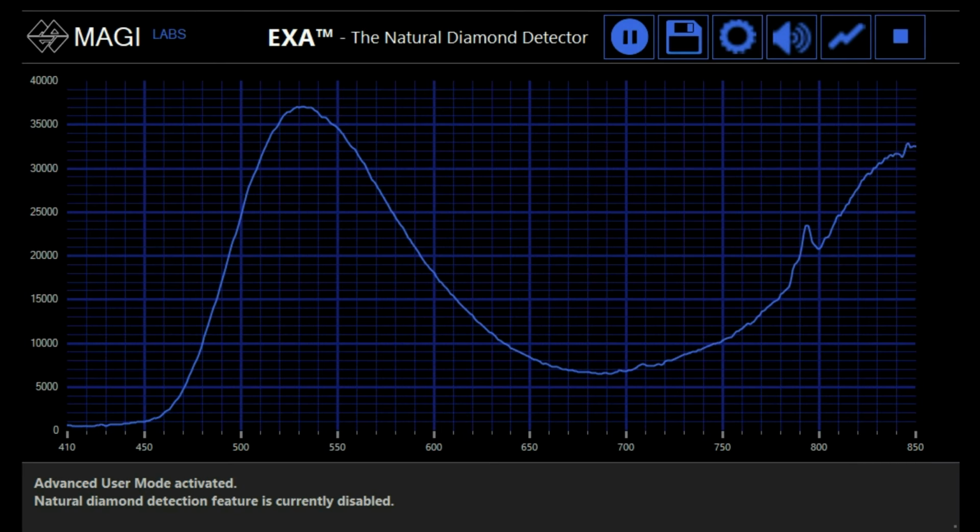In other cases, such diamonds can be pure IaA, where N3 can be missing or its reaction masked by the A aggregates. Here's the spectrum of a diamond showing a greenish-yellow reaction which has been referred in the standard mode. As you can see, the N3 peak and its sidebands are completely missing. Then we have this huge emission band, which is the graphic expression of the color of the reaction.